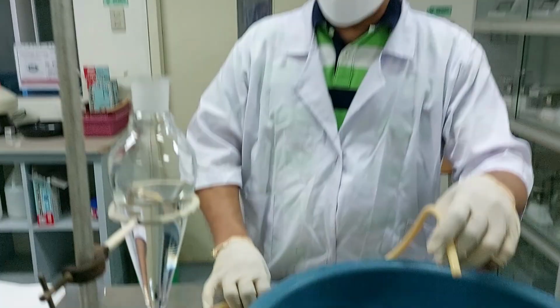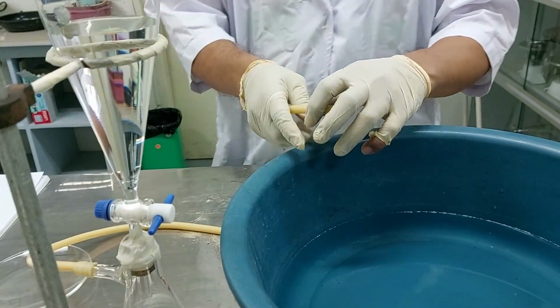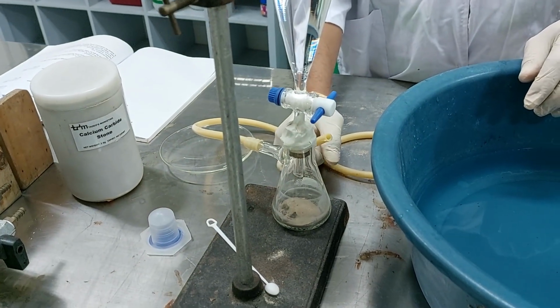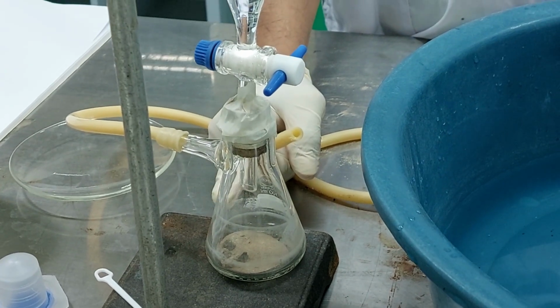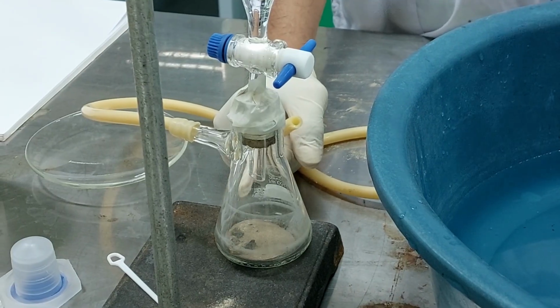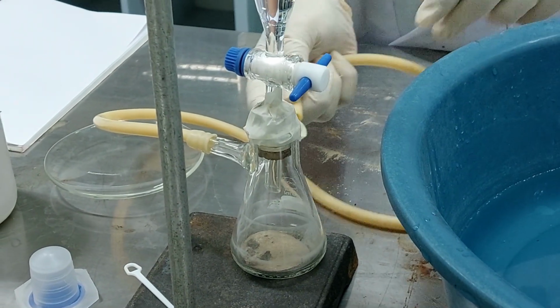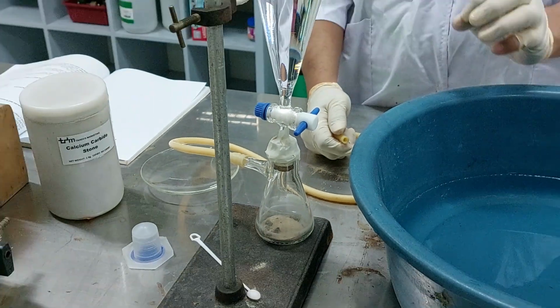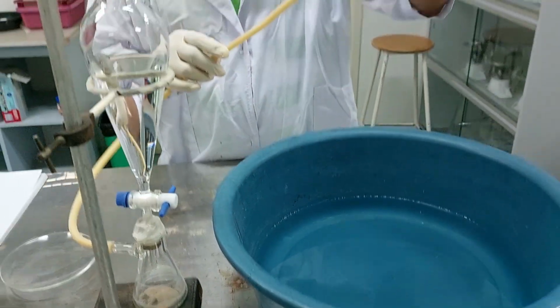Here, how is the acetylene produced? You have the calcium carbide. The water is added drop by drop, not all at once, because it will generate a lot of acetylene gas and it might explode. So in the synthesis of acetylene, you have to be very careful that you are just adding the water drop by drop, and the gas will come out here.